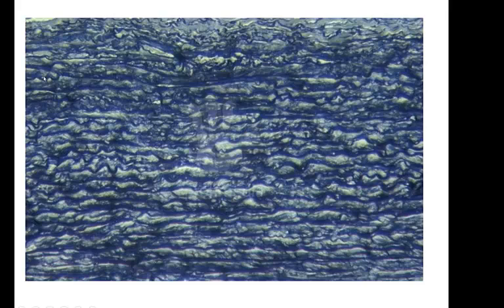So this is what elastic connective tissue looks like. It has all these squiggly lines. You don't see any background cells. You don't see any background ground substance. You just see these squiggly lines. And what these squiggly lines are, as the name suggests, are elastic fibers. So these are all elastic fibers. And the purpose of the tissue is recoil. It's elasticity. So if something stretches out, its function is to recoil after stretching.